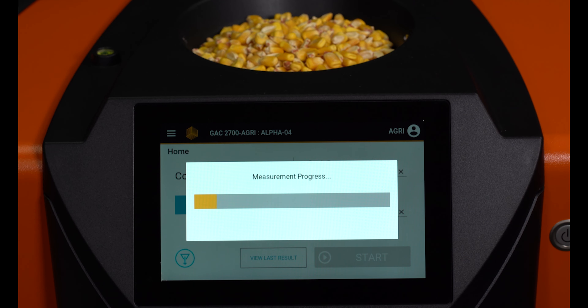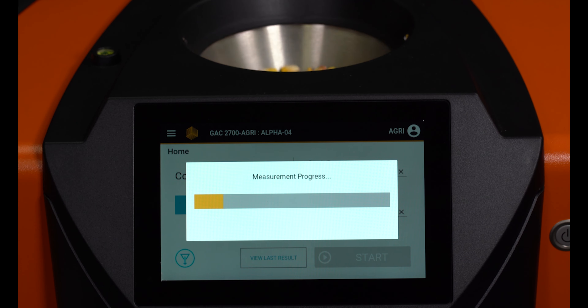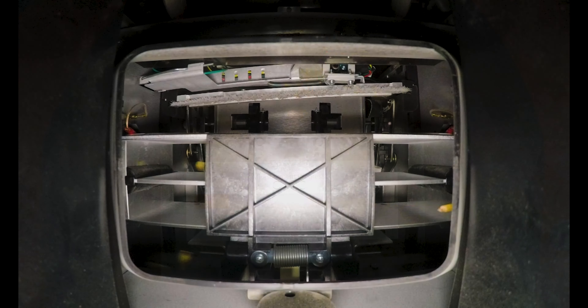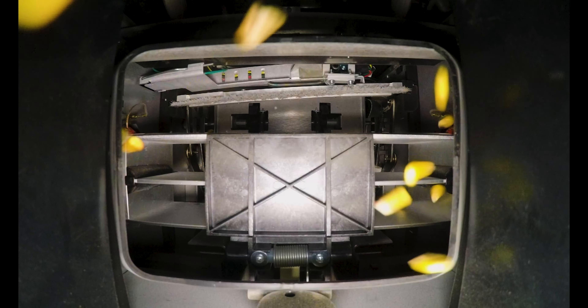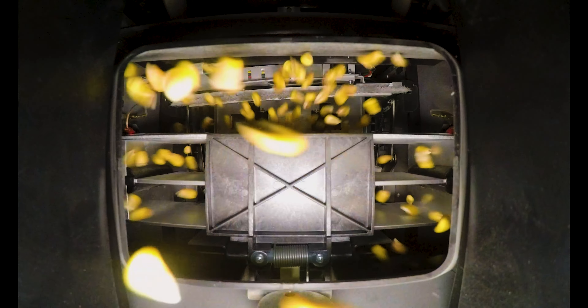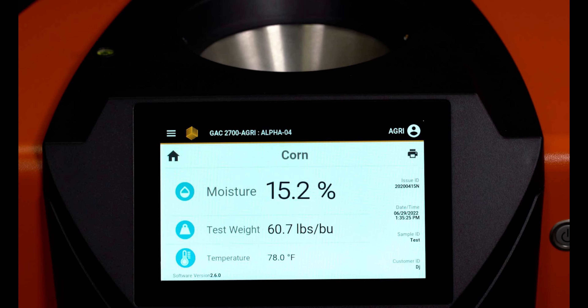The unit will now run the measurement tests of your grain sample. Once completed, the percent moisture, test weight, and temperature will be displayed on the screen.